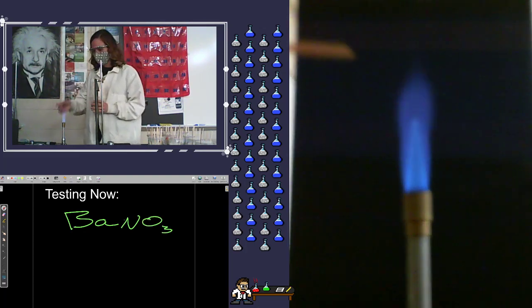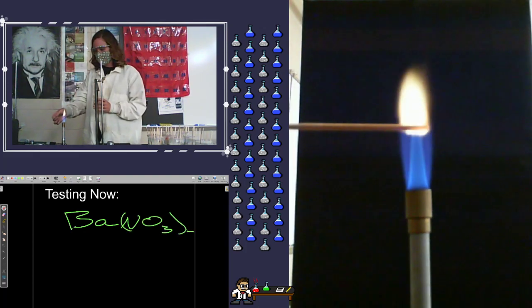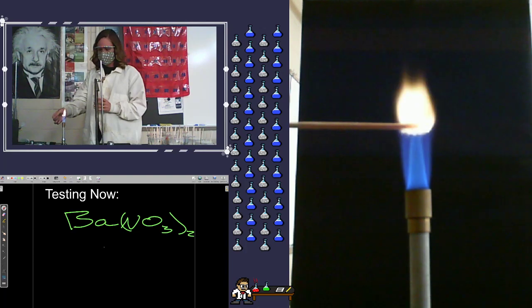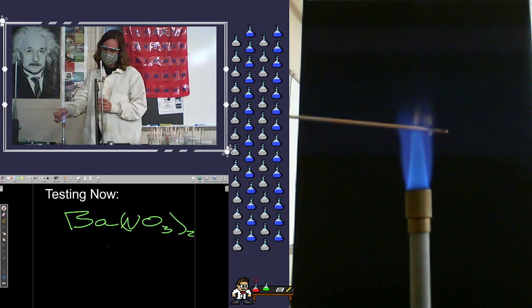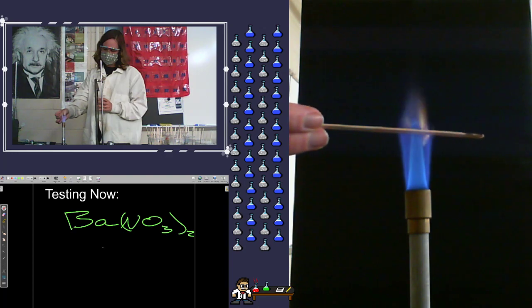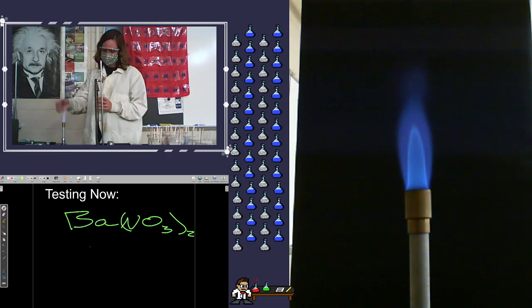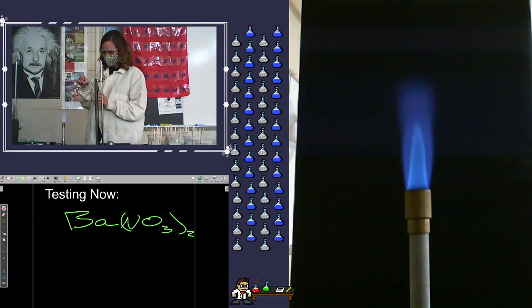But when I put it in the flame, you get a very distinctive flame color there. Excellent. So we've got barium nitrate to start off.